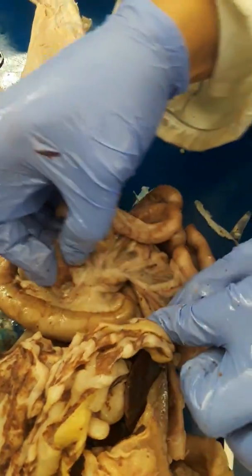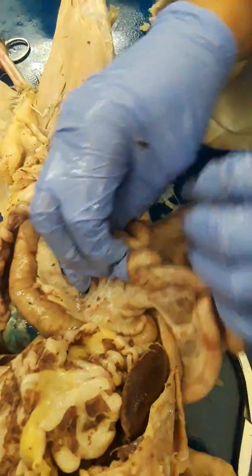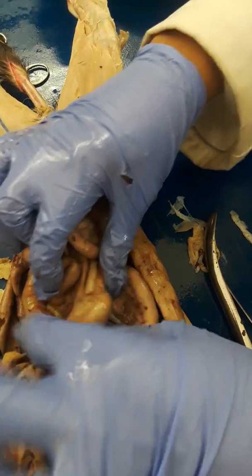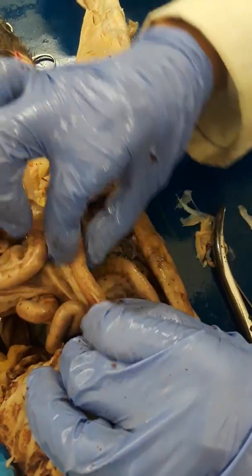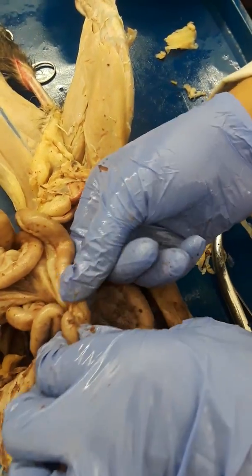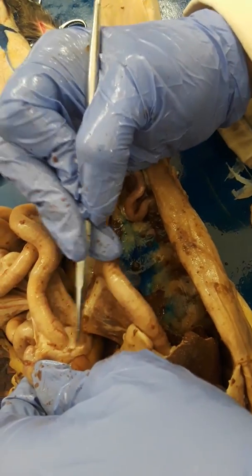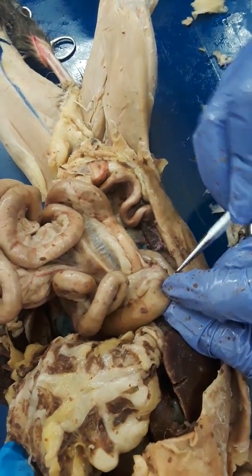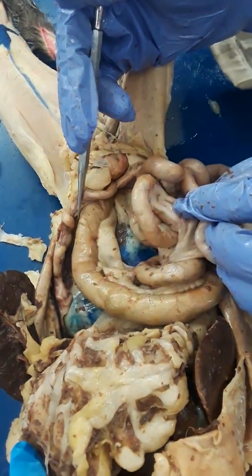So I'm looking for the large intestines. Flip it over. So this is the first part of the large intestines here. This is the last region of the small intestines, which is the ileum. There's a valve that's called the ileocecal valve, which is right up under this fat. So that's the ileocecal valve. This is the cecum. And then everything else is the large intestines.